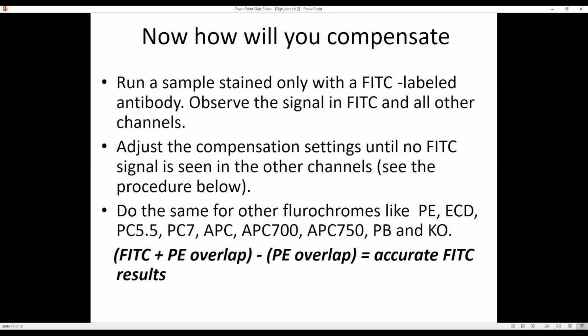Yeah, exactly. Senthil K says using single stain. Single stain. Very good. Perfect. Bang on. Single stain. So what is single stain? Anybody want to try? What is single stain? Yes, Dr. Vishesh, you want to try what is single stain?